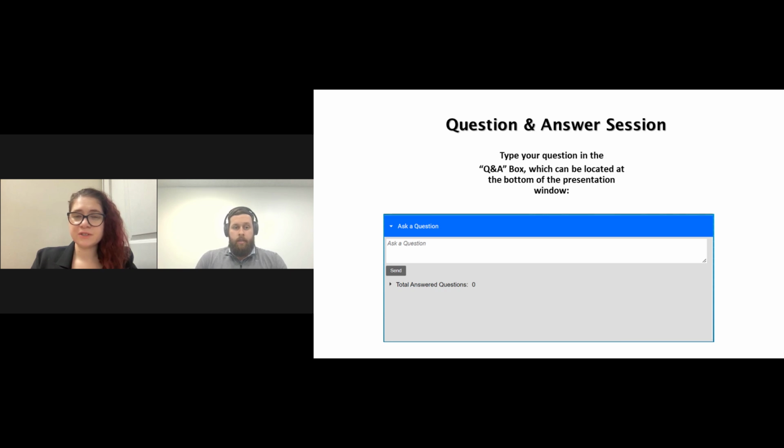Great, thank you. The next question we have says, is the GC-2050 using the same column as the other one, or is there a separate column made for it? Yes, absolutely. So the Brevis GC-2050, along with the GC-2030, all accept industry standard columns across the board. So whether that's Restek, Supelco, or whatever other vendor of column, traditional capillary columns, as long as they are the appropriate length, ID, and phase, there are no manufacturer-specific columns that the GC-2050 can't work with.